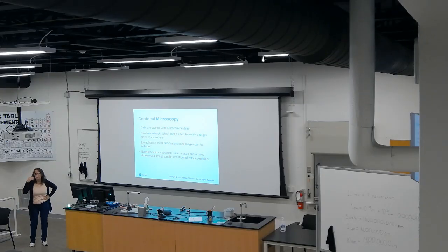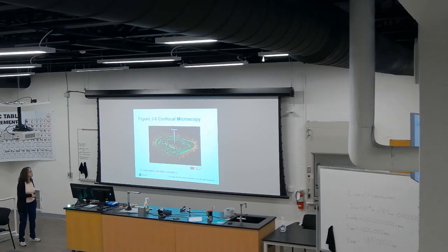Like if they take a CT scan of your body, you can see perhaps only the head, the neck, thorax, any part. Or you can stack it together and see the entire body. So here we have confocal microscopy of paramecium.